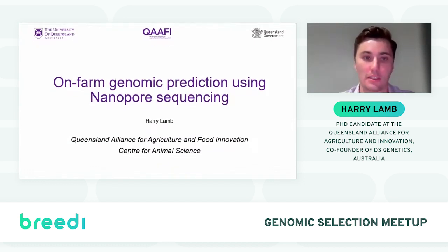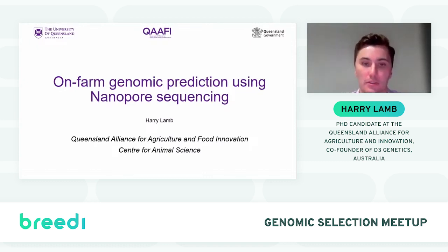Firstly, thanks very much for having me. It's a good opportunity. And today I'm just going to be talking a little bit about the work that I did during my PhD, which was looking at actually calculating genomic breeding values on farm for Australia's northern beef industry using a new technology called nanopore sequencing.